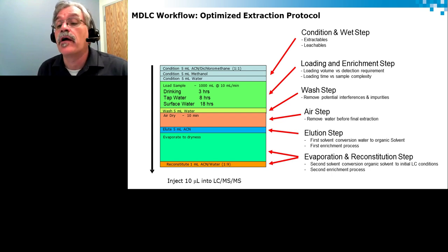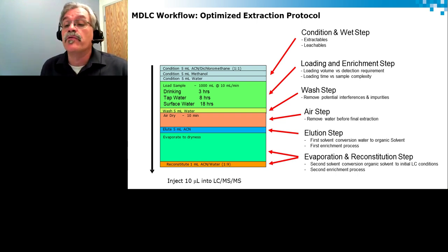There are actually a lot of manufacturers that will not take care in their manufacturing processes. That's the reason why we wash the sorbents first with a very harsh and large cocktail of solvents to clean out everything. The ACN dichloromethane is just one of several. Move towards a solvent that's more soluble in water, and then finish with water that would be compatible with my sample of interest. Now we have a loading aspect.